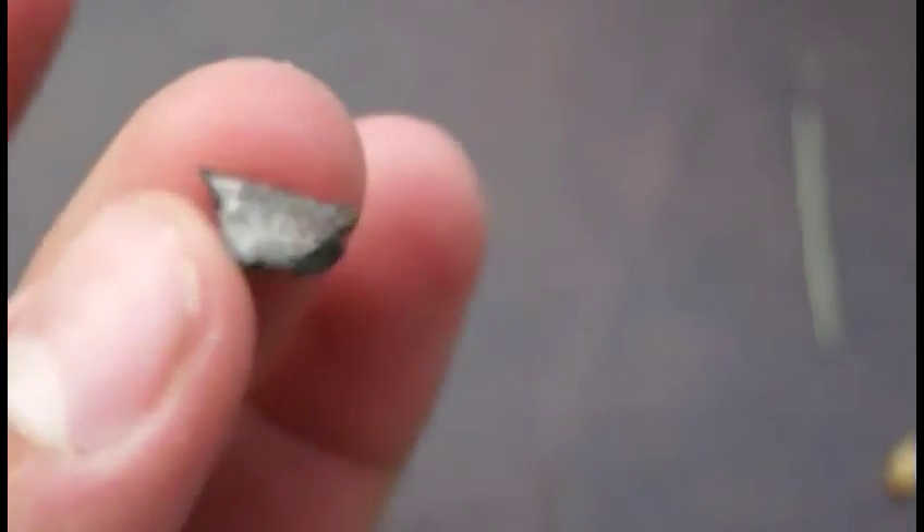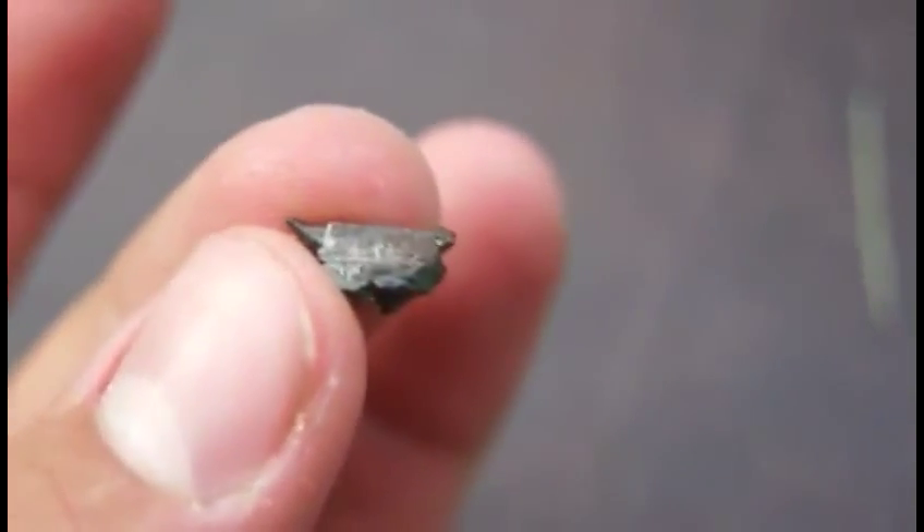Here's barium. I can hold it with my hand because it's not an alkali metal — well, it is, but it's an alkali earth, so it's less reactive. See how it's kind of shiny? It's pretty shiny. It's been left out pretty long, so it's not that reactive.